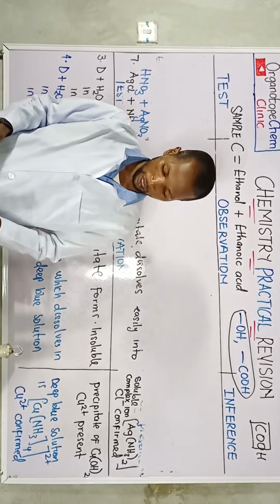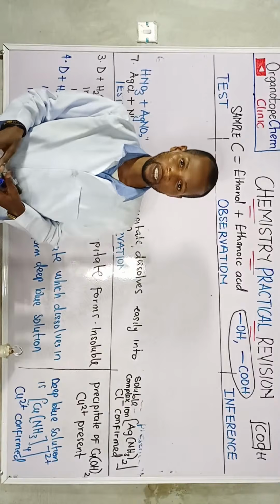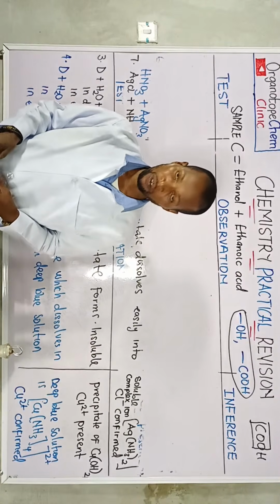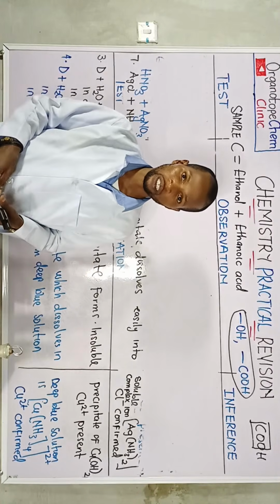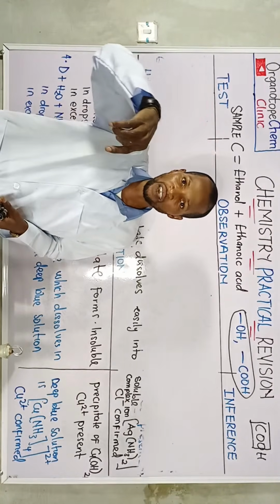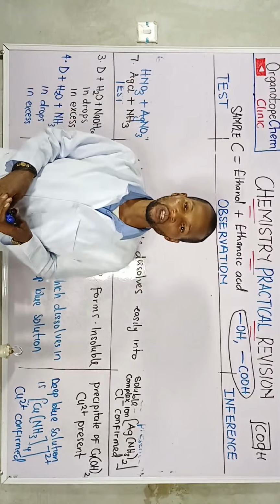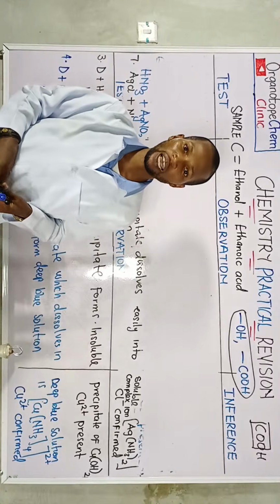All right, let's take the first reaction. We have sample C plus 2 molar sodium hydrogen carbonate with lime water. So we have a two-step process: the first is the reaction with sodium hydrogen carbonate, and the second is the gas evolved reacting with lime water. What is the molecular formula for lime water? Type that in the chat.